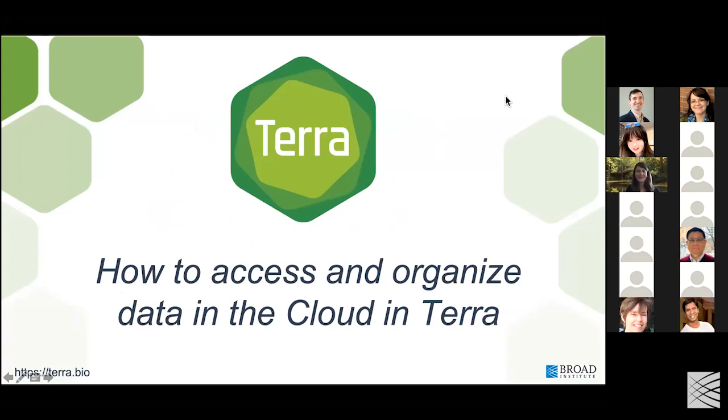Yes. Okay, well, thank you, Robert, for that intro to Terra. And as Robert said, I'm Liz Kiernan. I'm a science writer on our user ed team on the data sciences platform here at BroadE. And right now I'm excited to share with you how to access and organize data in the cloud in Terra.